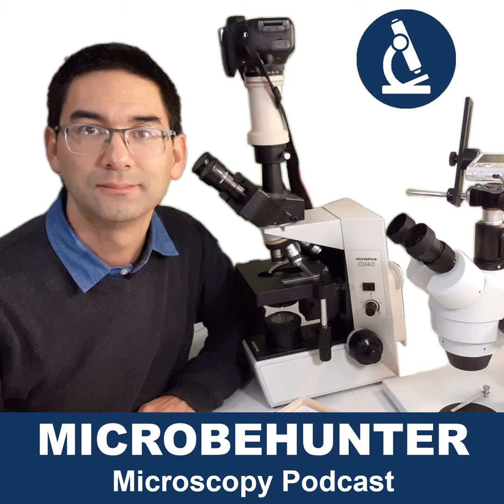Well, let's talk a little bit about microscope magnification and the magnification that you need to observe the things that you're interested in. When you go microscope shopping, often in catalogs or nowadays more online, you will see a whole range of microscopes being advertised. One of those parameters that the vendors always use is the magnification. You can buy microscopes sometimes all the way up to a magnification of, let's say, 2,500 times, totally unrealistically high in my view. We'll talk about this later.